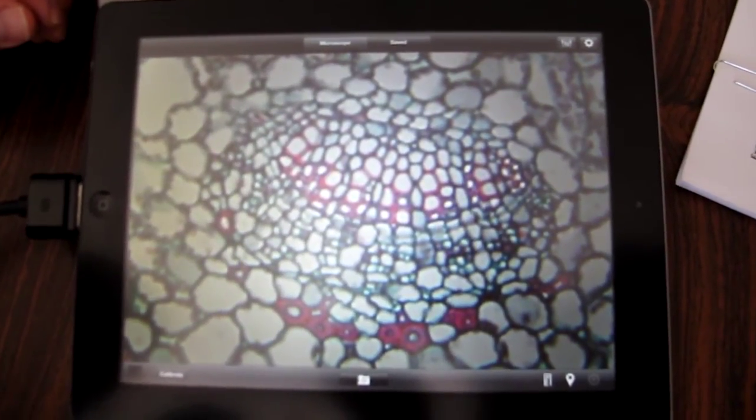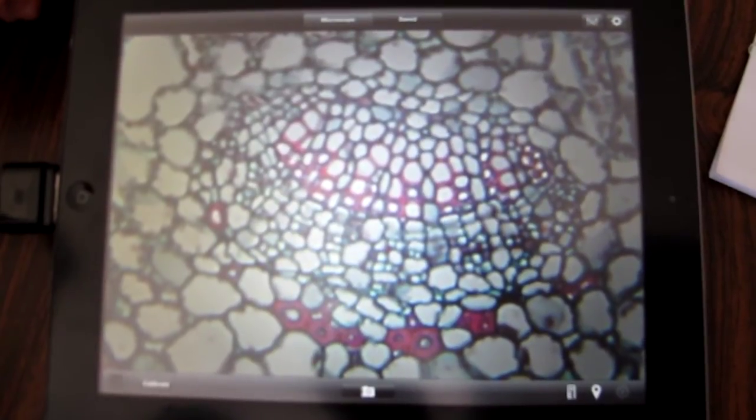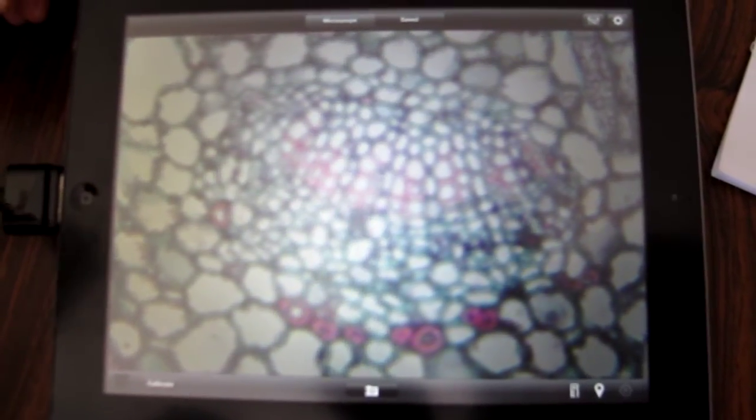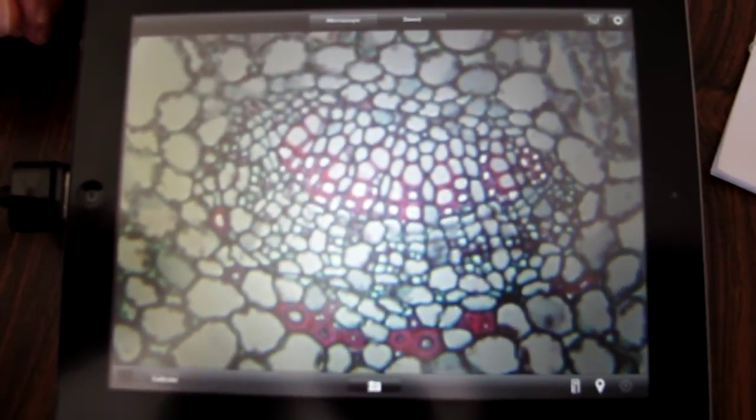We're looking at a typical herbaceous dicot leaf. Now you could just... viewers might recognize the phloem and the xylem. But now we're gonna identify... as biology teachers there it's starting to flow them.